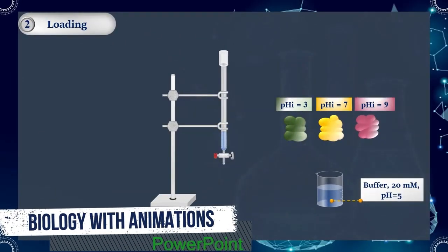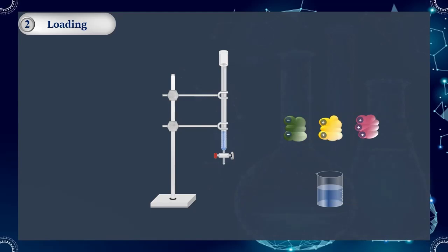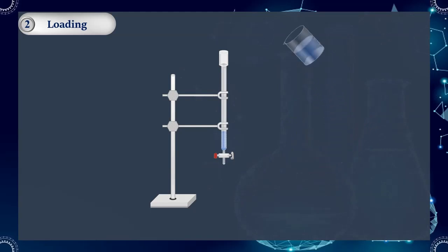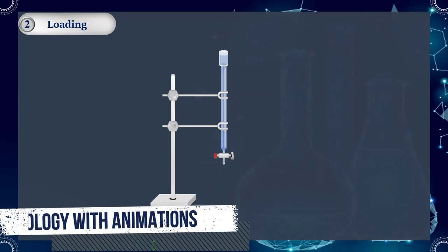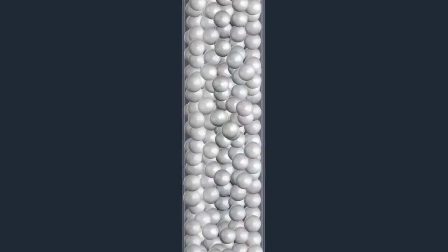If we apply cation exchange chromatography, protein that has a net positive charge will bind to the negatively charged beads of the stationary phase. On the other hand, uncharged proteins or those with a net negative charge will not bind. They pass through the column at the same speed as the flow of buffer. When all the sample has been loaded, the next step is column washing. The column is washed with start buffer to ensure that all non-binding proteins have passed through the column.